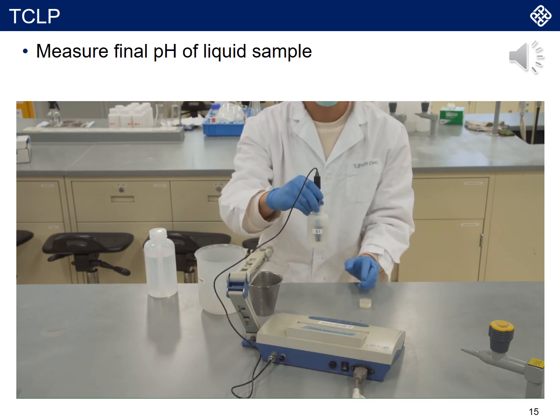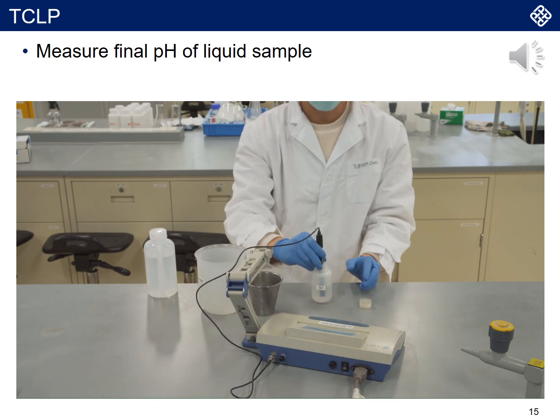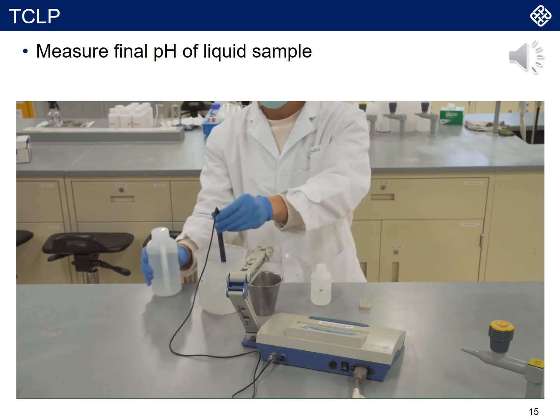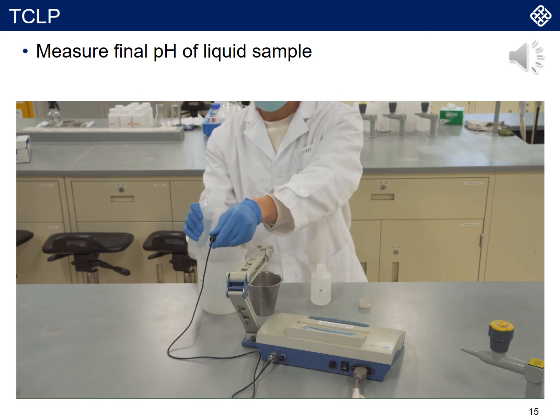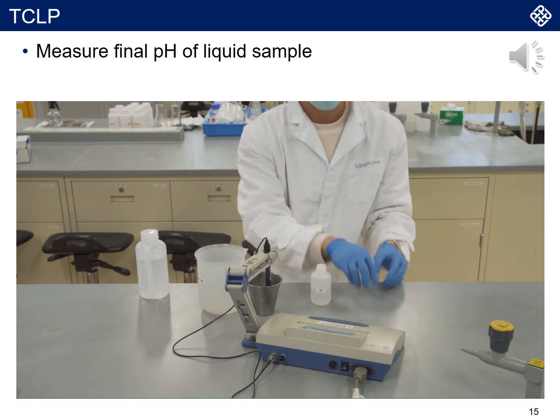And then, before you use it, the pH probe needs to be well calibrated. Basically, you will have two types of buffer, fixed at standard pH values, to help you provide the standard curve. Okay, so now we have finished all the experiments.